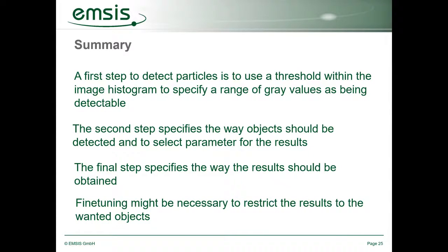So I hope this was an interesting tool for you to see what is possible with a threshold-based particle detection process. The first step to detect the particles was to use a threshold within the image histogram to specify the range of gray values which should be detectable. A very decisive step.